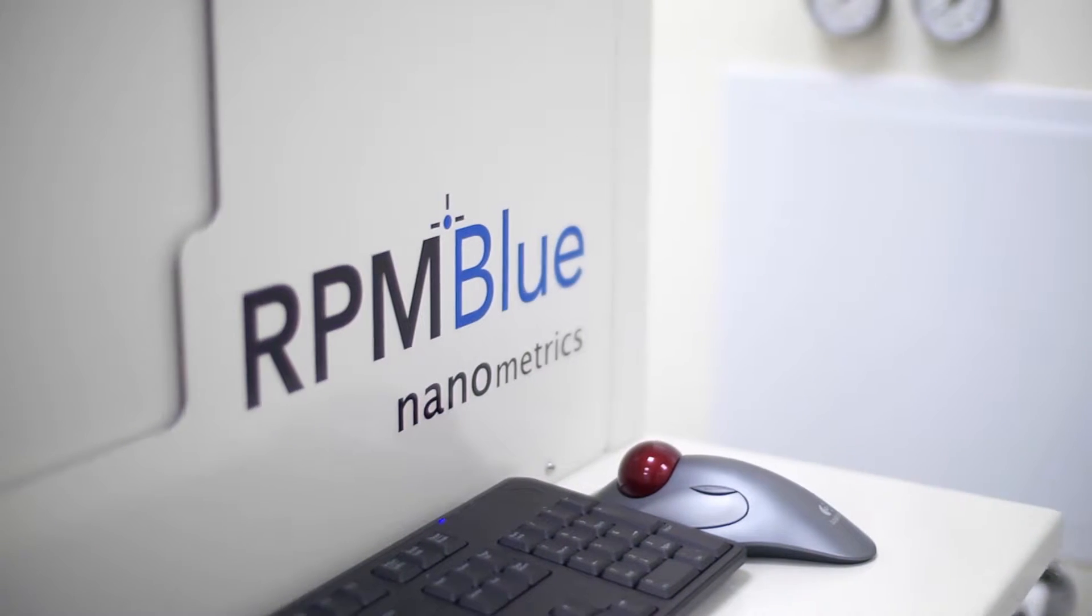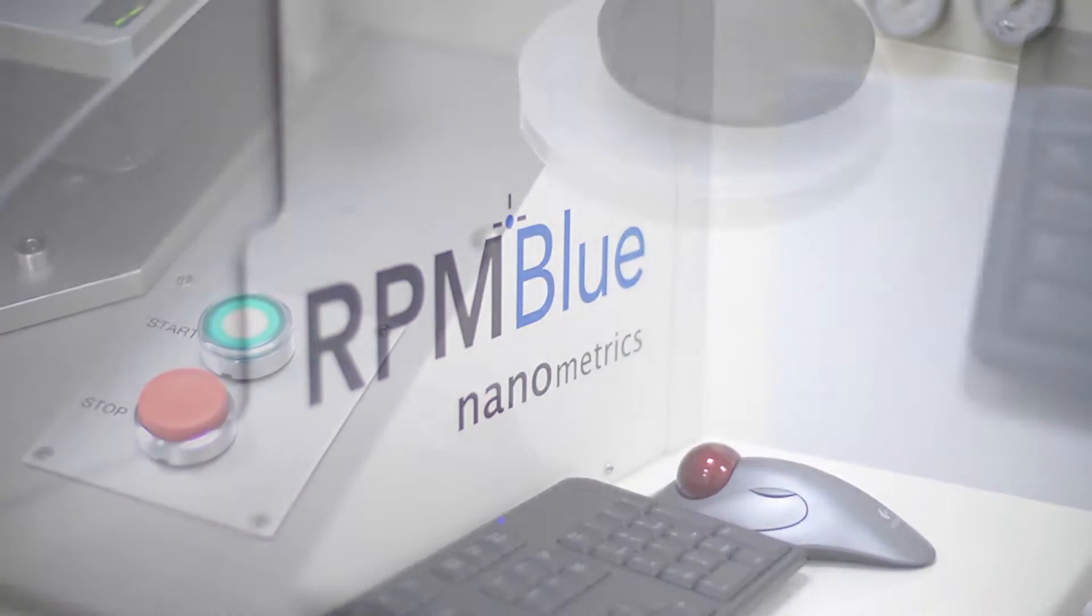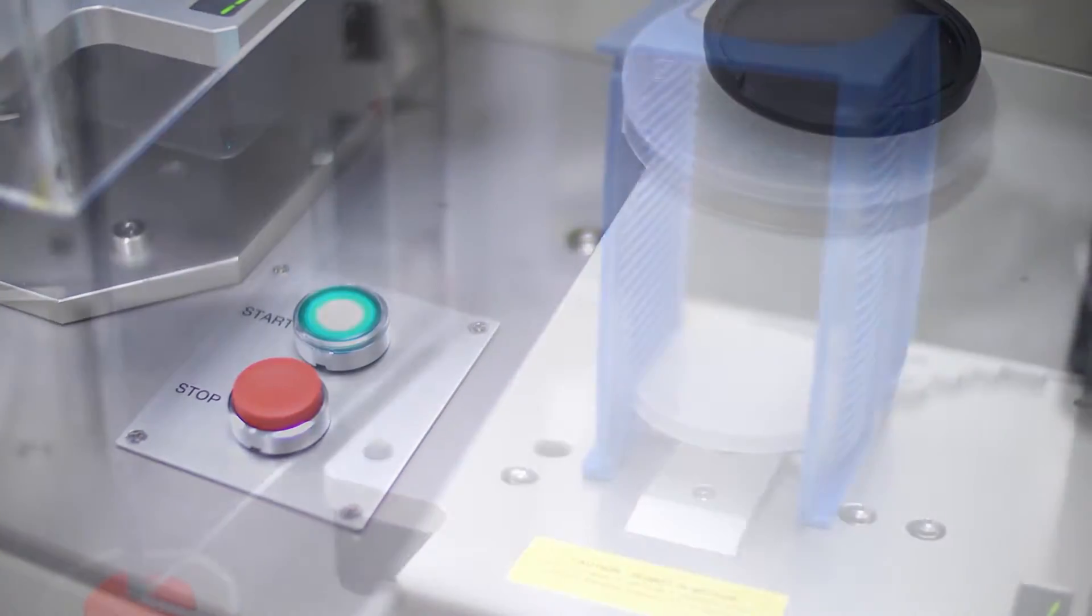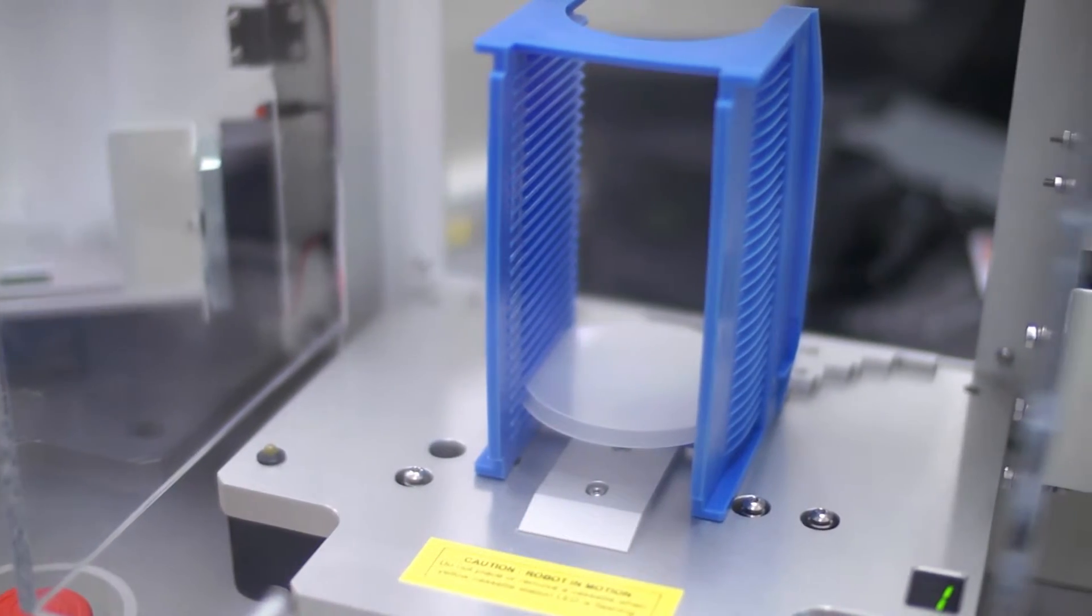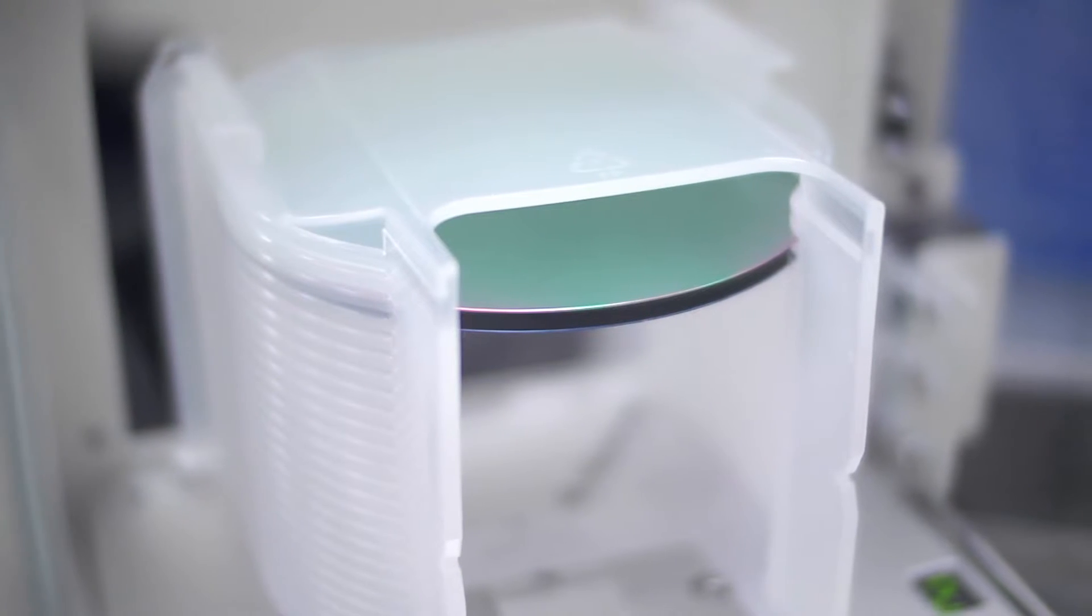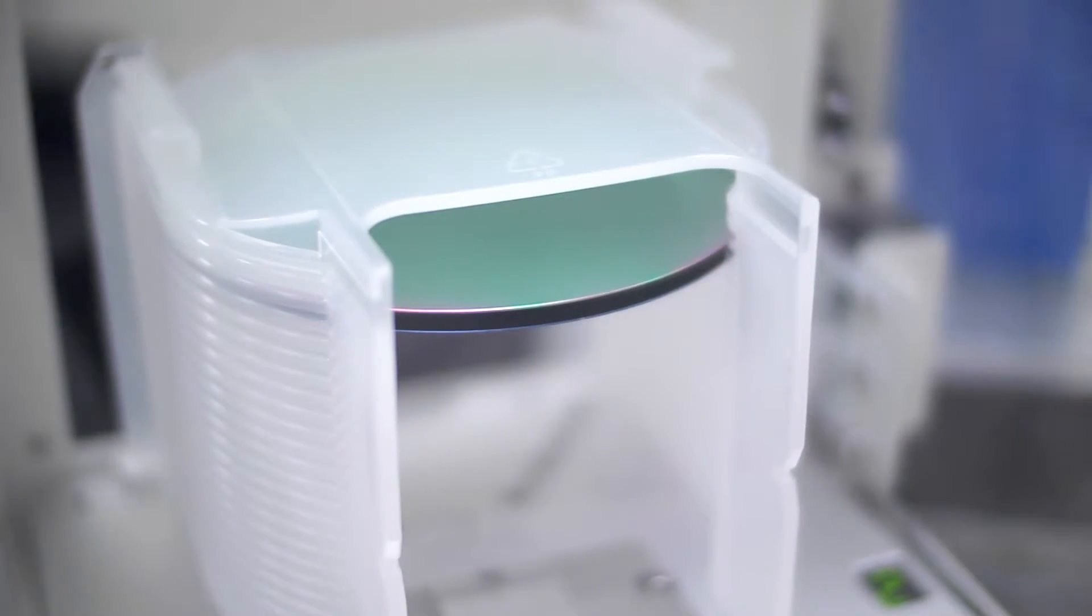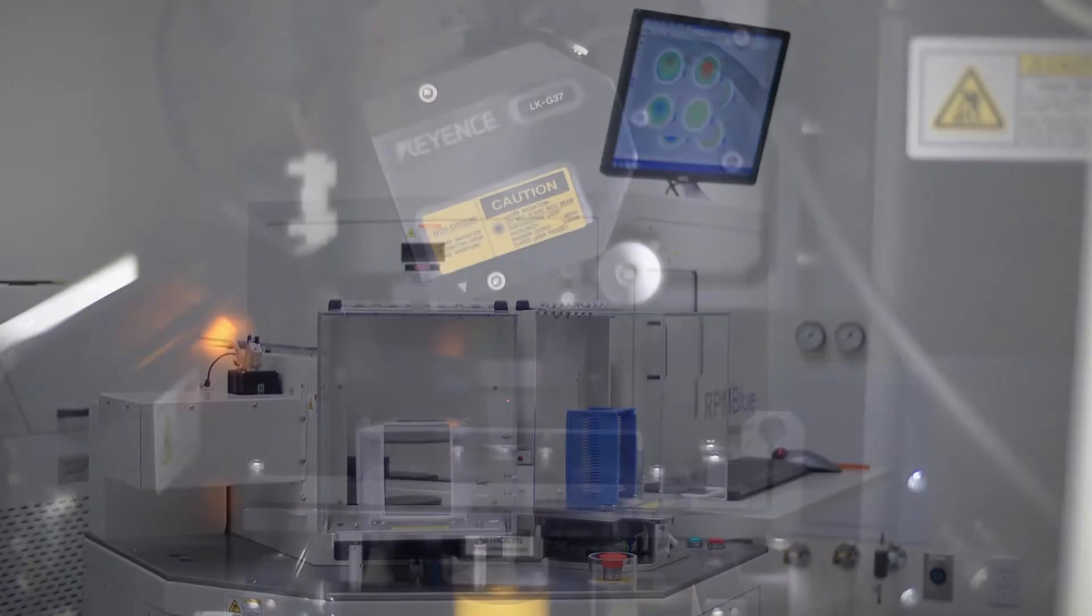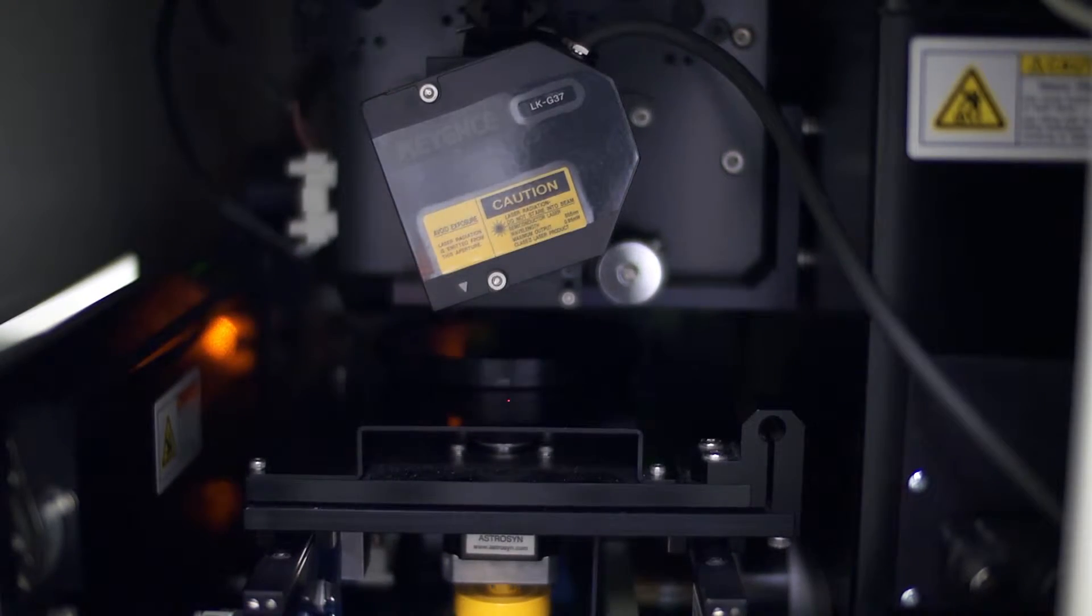Introducing the RPM Blue, the next-generation photoluminescence tool from Nanometrics. With a very flexible configuration, the RPM Blue has a research-grade 300 mm focal length monochromator that can cover wavelengths from 200 nanometers into 2.6 microns.